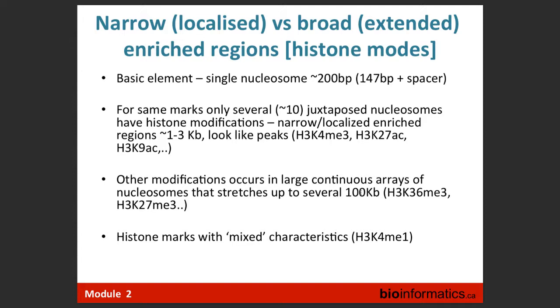And we know that at the transcription start site, exactly at the transcription start site, we often have a mark like H3K4me3, or we have a transcription factor, some protein binding in our promoter. We have a nucleosome-free region, and we have frequent breaks. So if we profile input around TSS, and I think I have this, you see a peak there. And it depends on the technology.